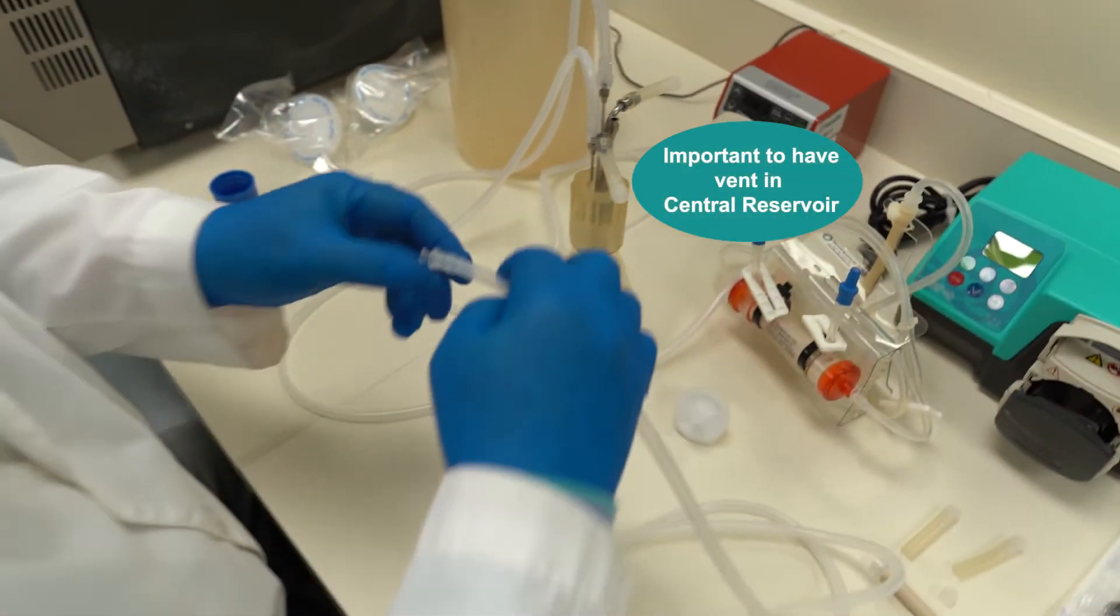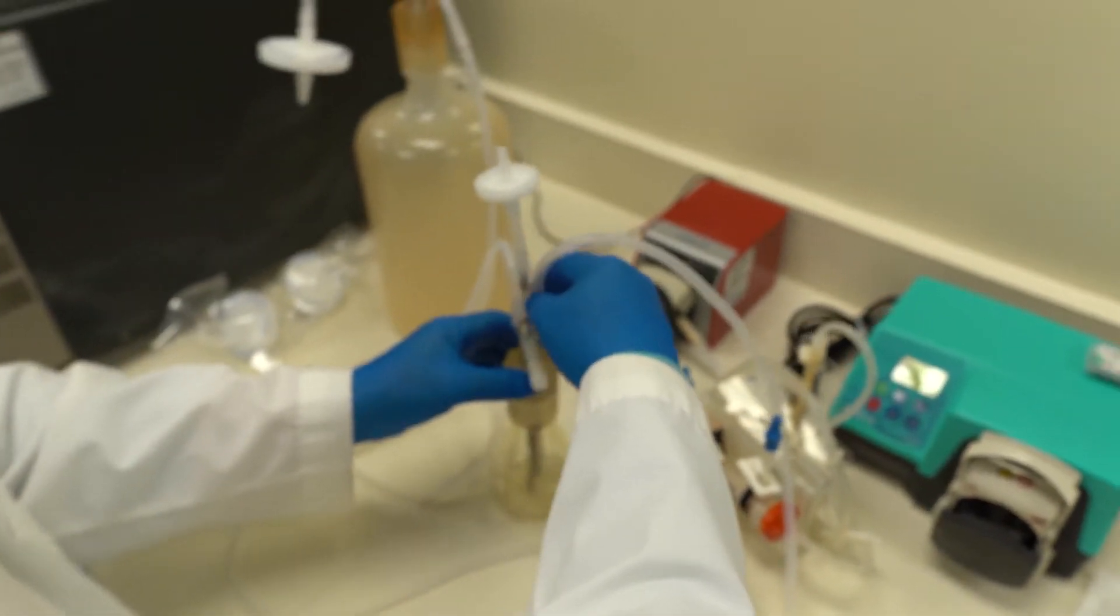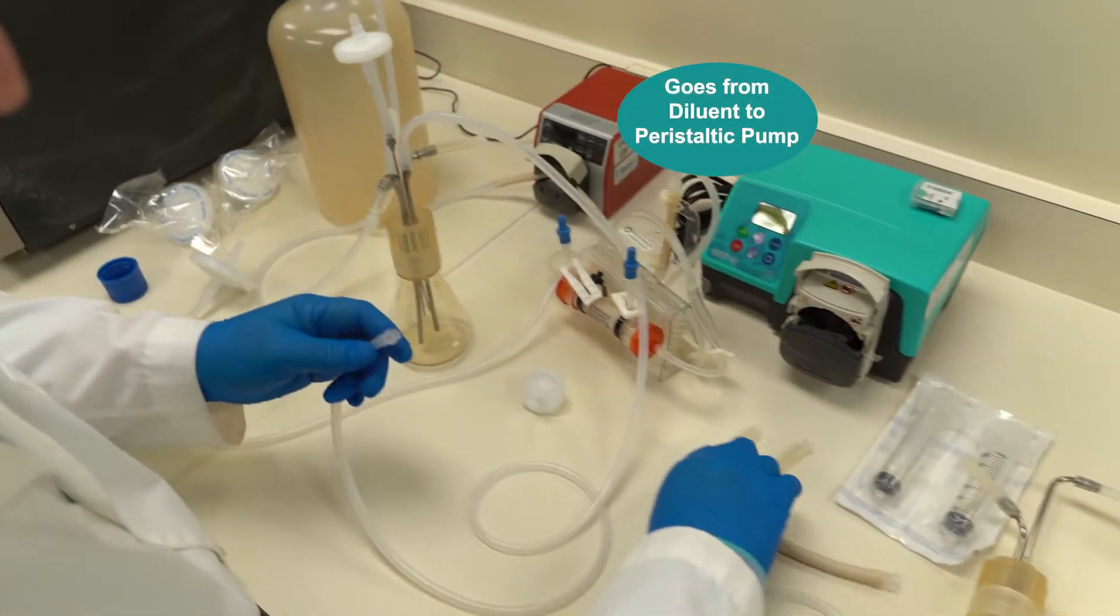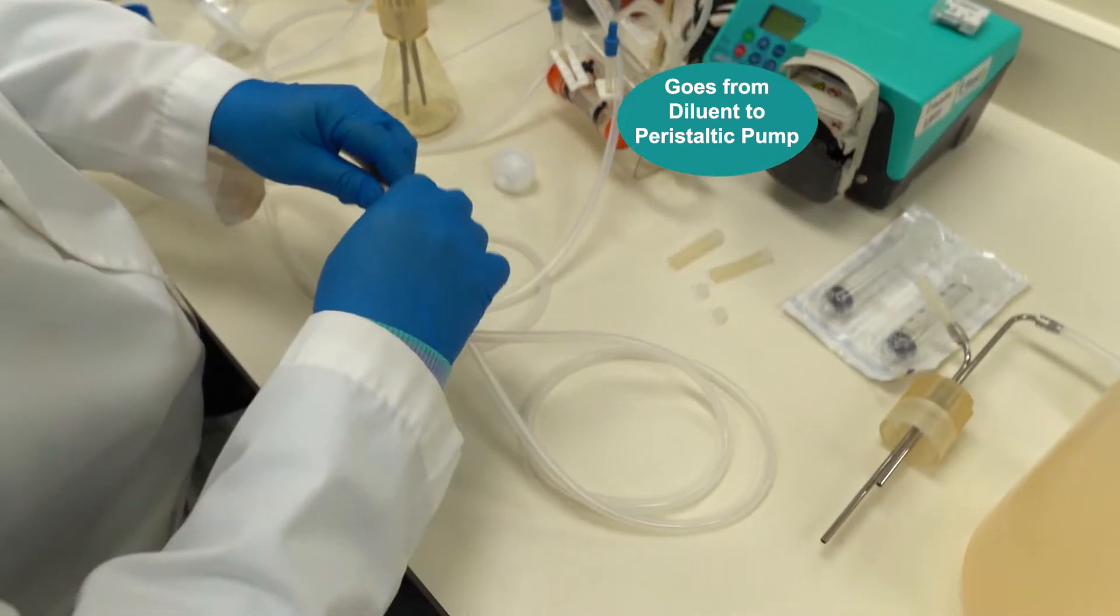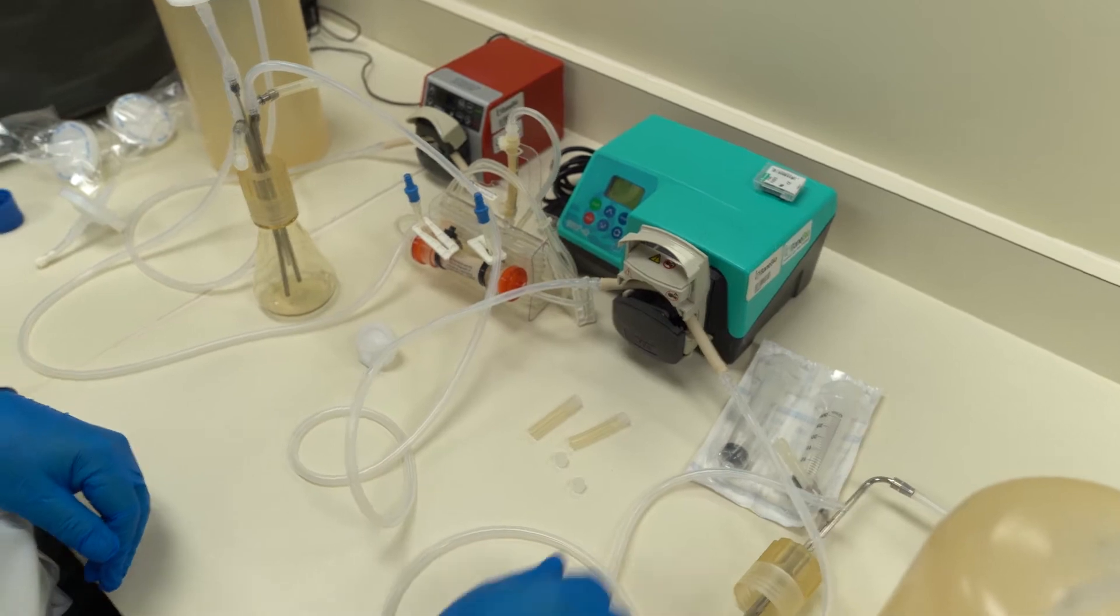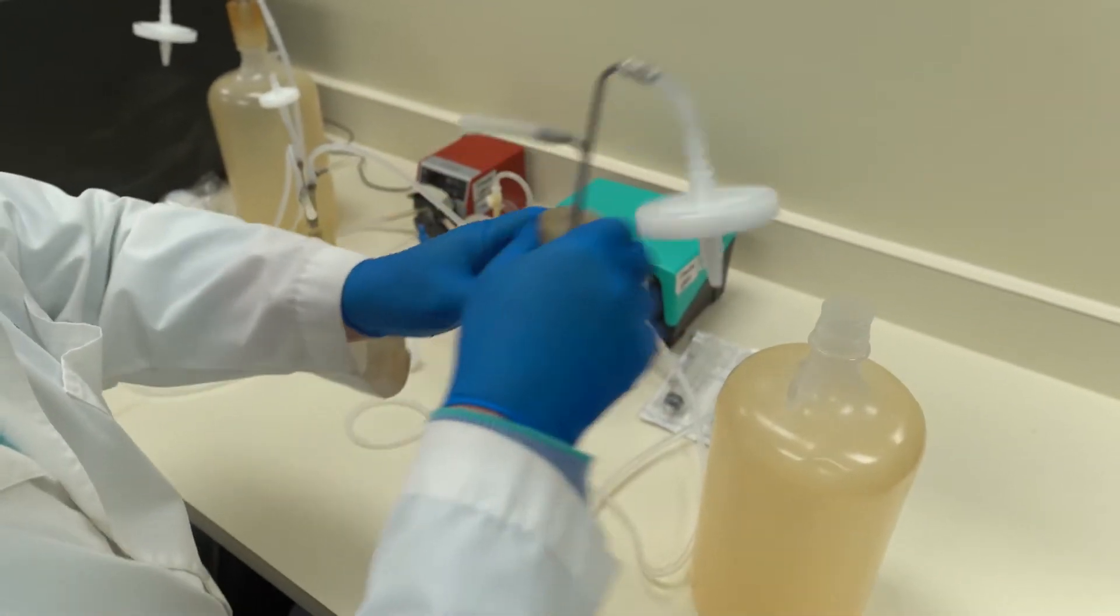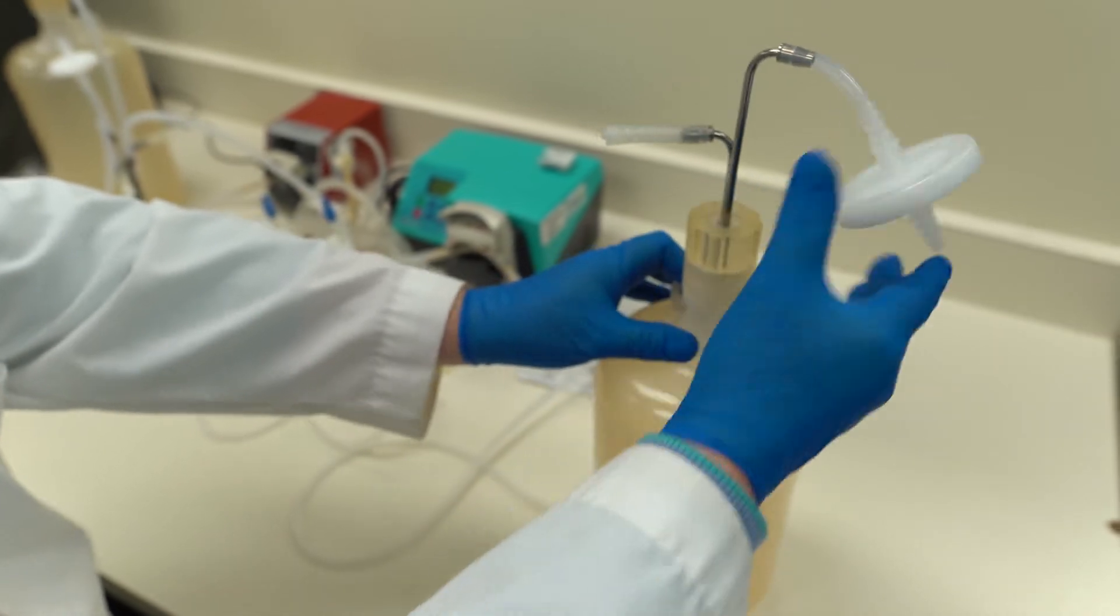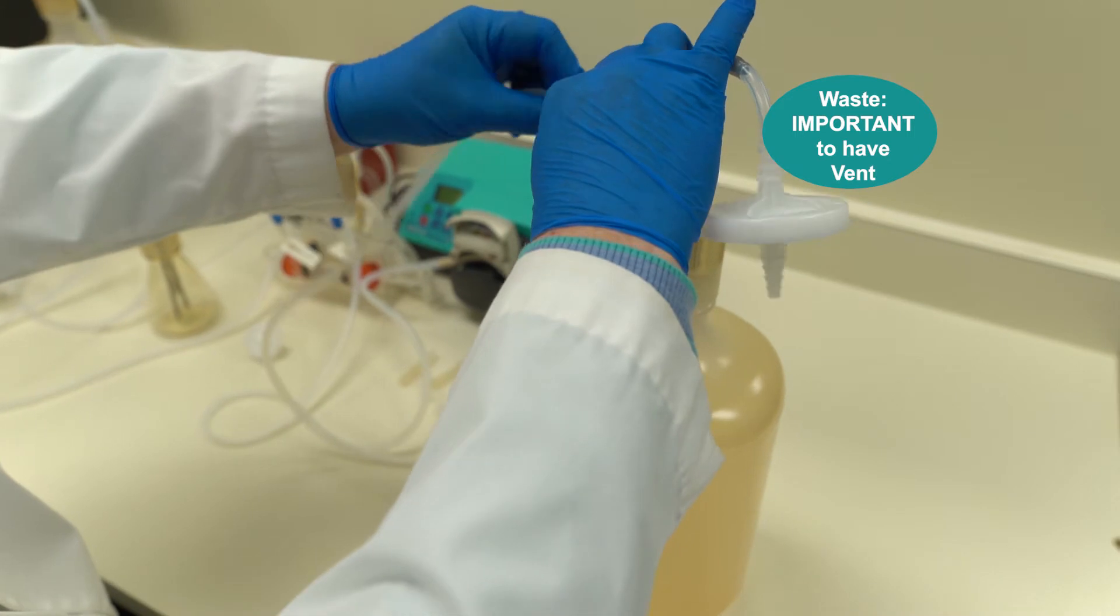Now from here we're going to go to our diluent. Diluent out. Through the peristaltic pump. This is pump tubing. I can just go into the peristaltic pump like that. And then here this is for our waste. So it's not so important that we have tubing to go to the bottom but it is still super important to have a vent.